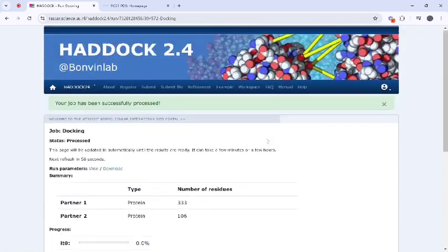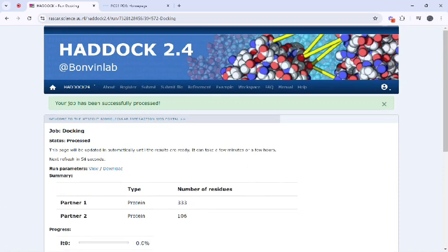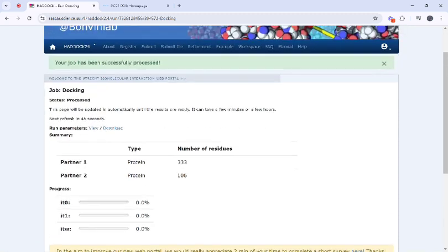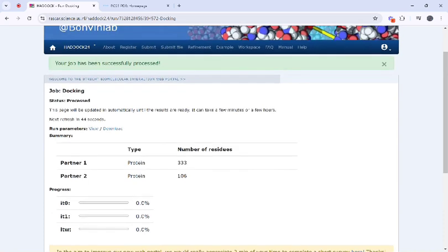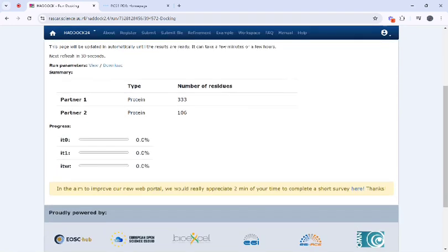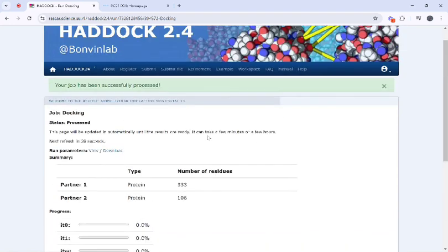Once everything is done, depending on the server load results may take some time and you will receive an email when your docking results are ready. They will also show you the number of residues in both proteins. Then you can wait for your docking result and analyze it using PyMOL.